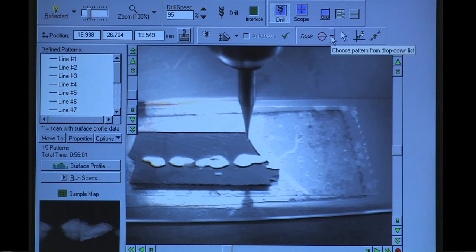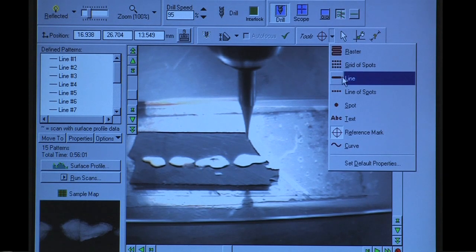Once finished, choose the appropriate tool from the tool button again and map out the area you want to drill on the sample.